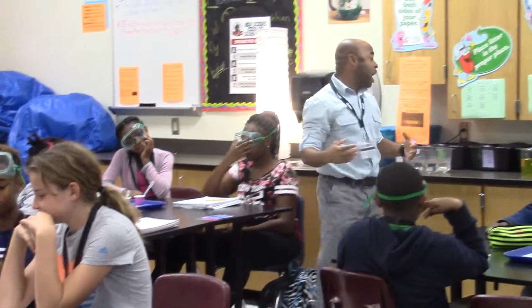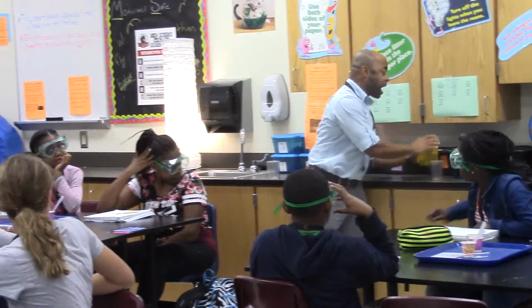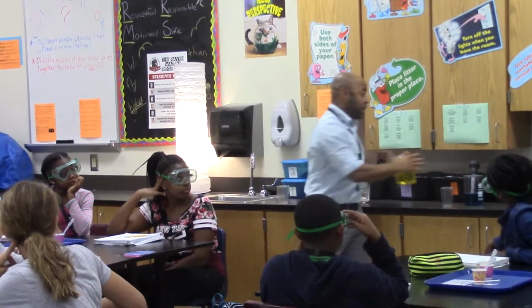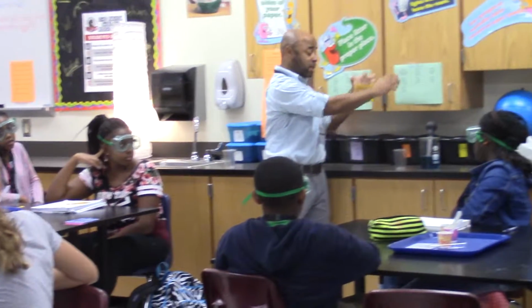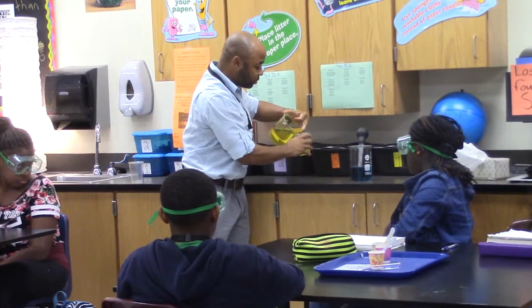So for example, I'm going to do one real quick, and this is just a sample. I'm using two. In this one, I have some hand soap, and I have some blue colored water. I'm going to predict that the hand soap is a little bit more dense than water. So how will I do it? I'll add some hand soap.